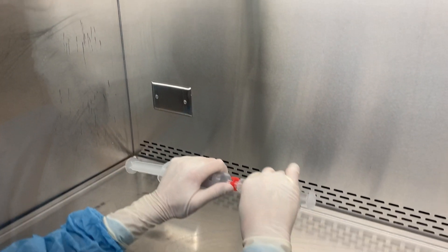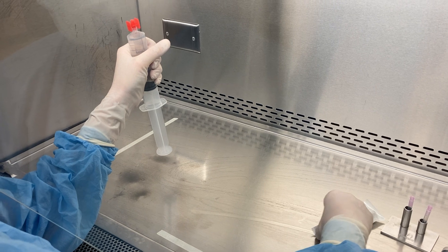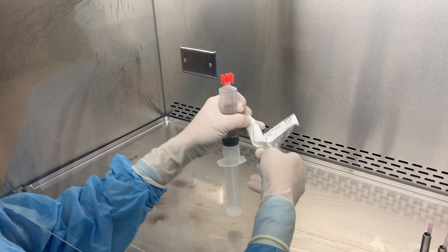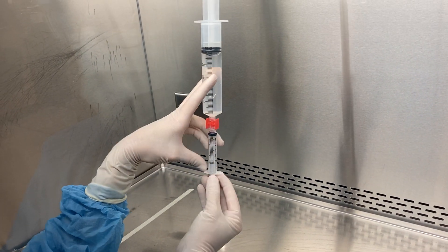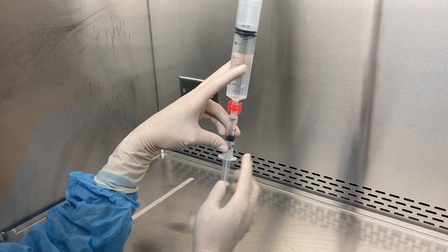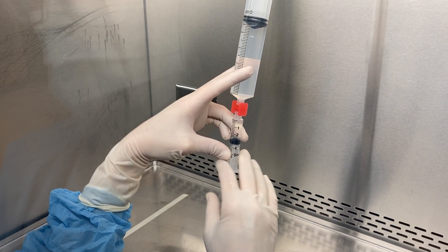I can also use this RapidFill connector to draw up smaller doses into other syringes. So here I'm going to draw up three mLs into a syringe.